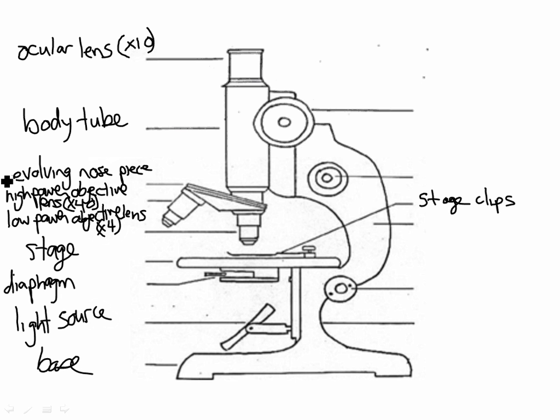And I don't really know what around the corner here this is pointing at, so let's assume it's the base as well, okay? Working my way up the back side, this particular thing right here, I believe is showing us on this old one, this bolt here, which allows the microscope to pivot back and forth. It's not really on any of the other pictures. I'm going to just put here a pivot. All right, it's a pivot point. It allows it to bend back and forth.